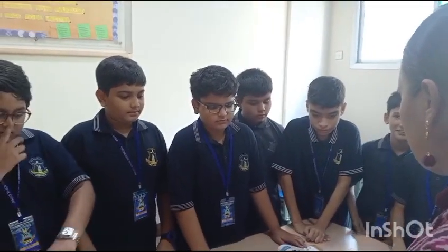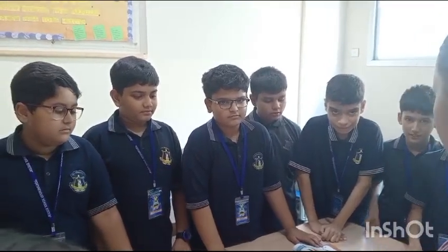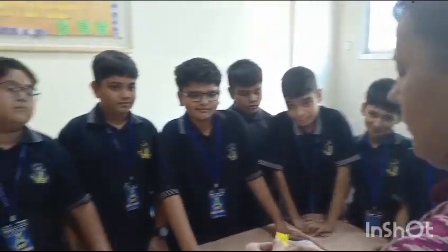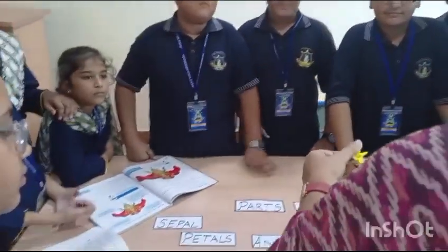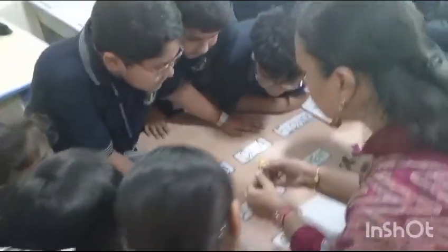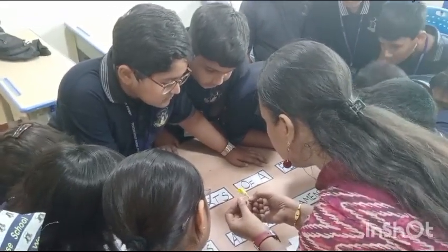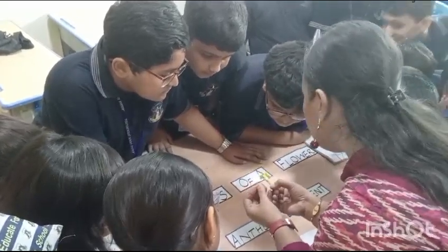We are going to study the parts of a flower through dissection of a flower. So for that we take one flower, okay, and now come closer. Now you can see this part. Can you see that? With the help of a needle I will separate these.